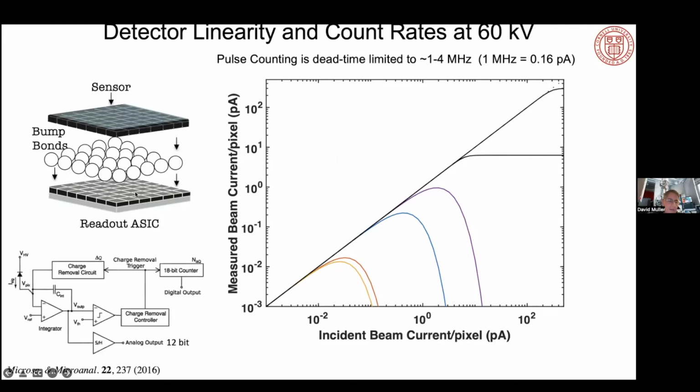Sols has this hybrid design of detector where you can think of the detector as basically a big bucket of charge, and you're scooping charge out of that detector with a cup. And as long as I scoop charge out with that cup very quickly, it's never going to saturate, as long as I can have my removal rate quick enough. And that's actually a fairly easy thing to arrange.